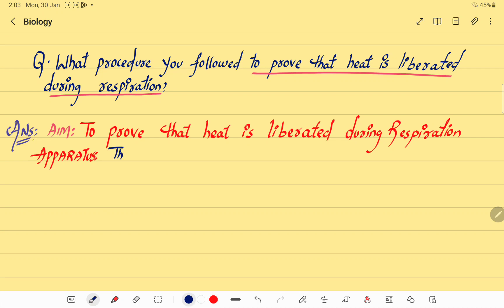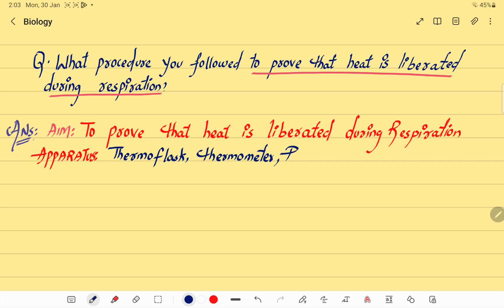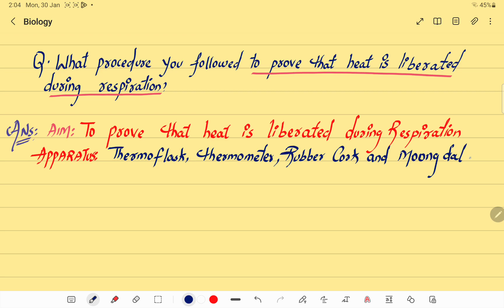Now let's check the apparatus required for the activity. The apparatus are: a thermoflask, a thermometer, a rubber cork, and moong dal.